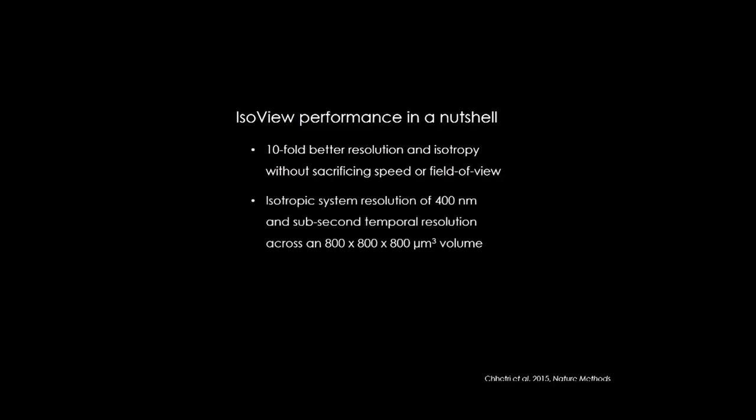So let me just summarize this. We have basically an improvement of about tenfold in resolution without sacrificing speed and field of view. In more absolute quantitative terms, that means 400 nanometer system resolution at sub-second timescales for a volume of about 800 microns cubed. And I just showed you very short sequences from actually longer imaging experiments. We've imaged these samples for hours to days in each of these cases, so you can use it under physiological conditions in this parameter space.